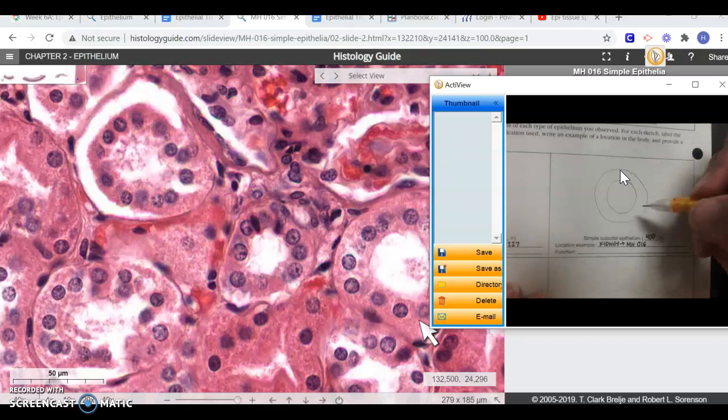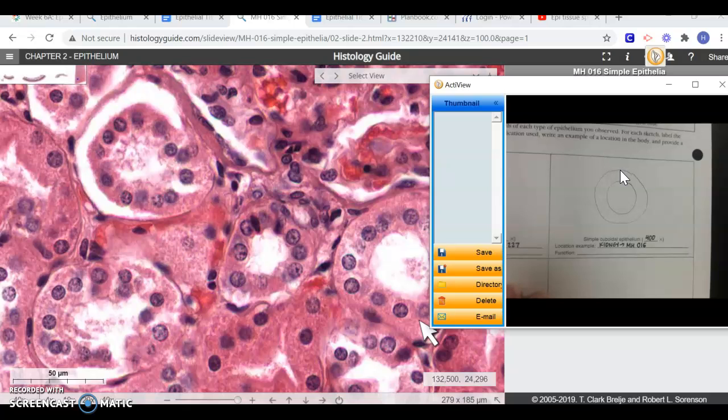And then what happens is, this is showing my simple circle of cells, and sometimes that's how it is. They're not just going to be in this flat row, but that's a really cool thing. It lets us see how this really is inside of our body. And our kidneys have a whole bunch of tubes to be able to filter our urine, and so it's really cool how they work, and this is kind of showing us that.